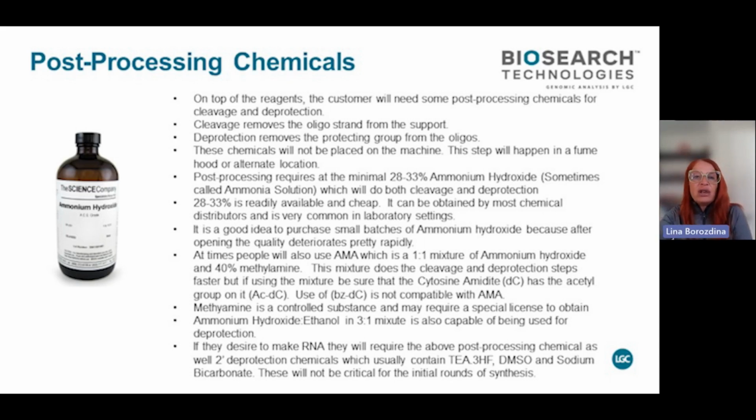As I say, ammonia is readily available. It's cheap. I would recommend you buy smaller bottles, refrigerate them, and after opening a certain amount of time, you dispose of it or send it to biology labs so they can do some buffers.